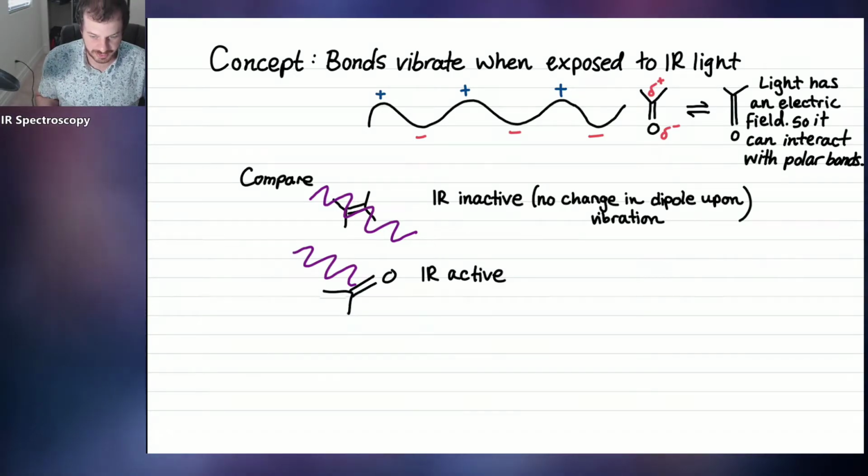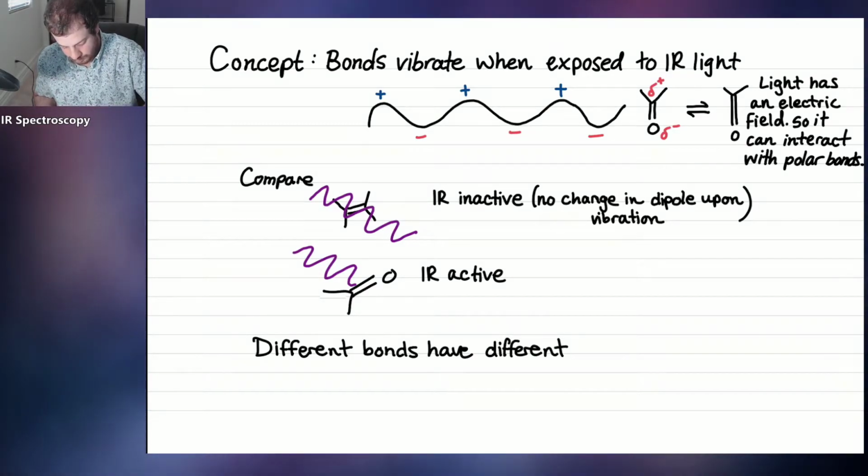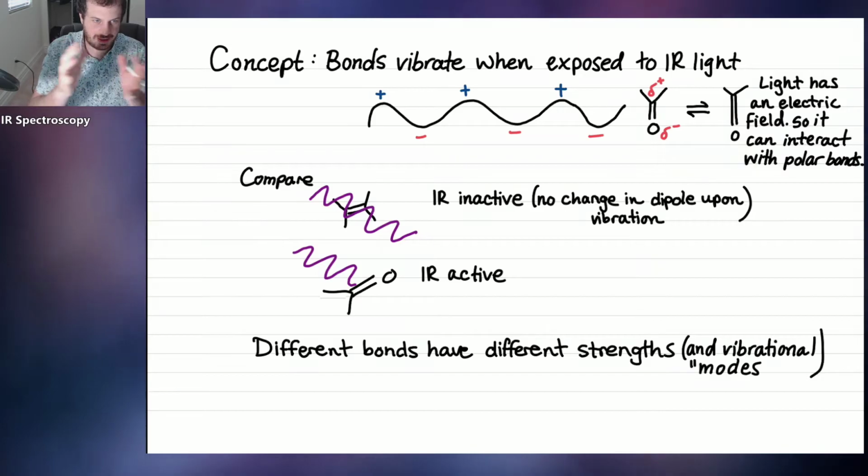Now here's the fun part. Different bonds have different strengths. And also vibrational modes. Vibrational modes just means they can vibrate like this, or maybe they vibrate like this, different ways to vibrate.